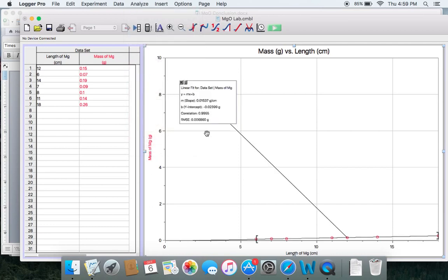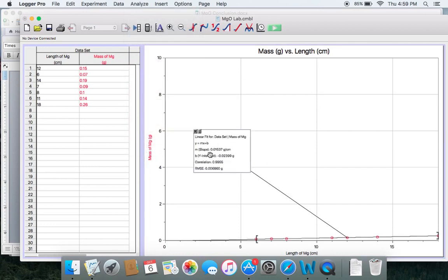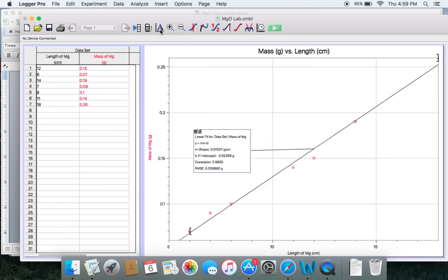There's our slope. You probably want to just click on this A symbol here — it means autoscale. Once you click on that, you just get a better fit for your curve.